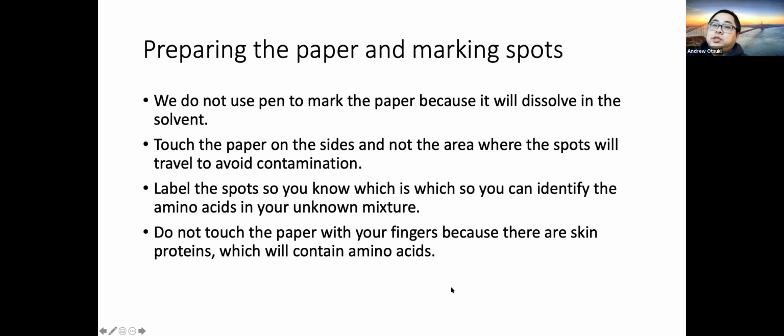Okay, so let's talk about this. I encourage you to read these things because some of them might help you answer the post-lab questions. I may have given you maybe a hint. So it's very important that you read these. Okay, we do not use pen to mark the paper because it will dissolve in the solvents, and that may cause problems. So we don't want to use pen. We use pencil because graphite won't dissolve in the solvent.